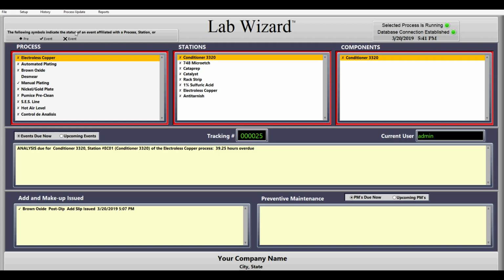Every technician that uses the software will need to log in right over here. That way there is accountability and you are able to see exactly which technicians are doing what kind of work.